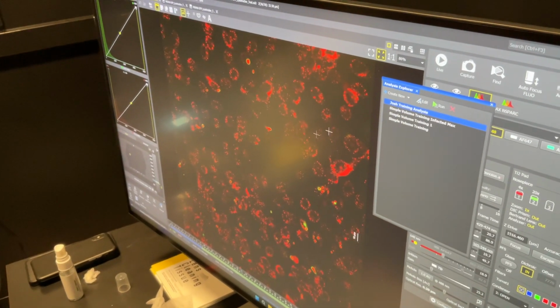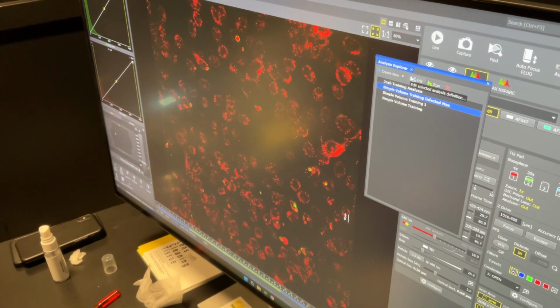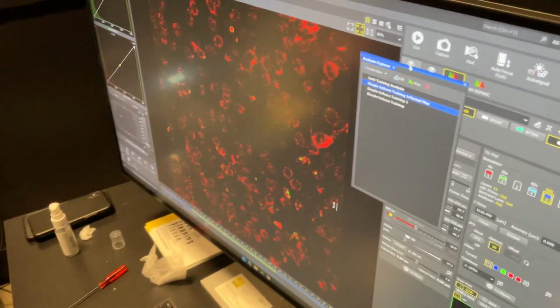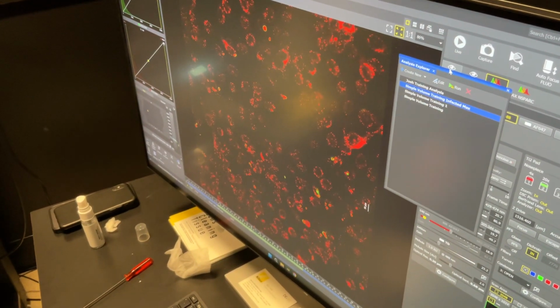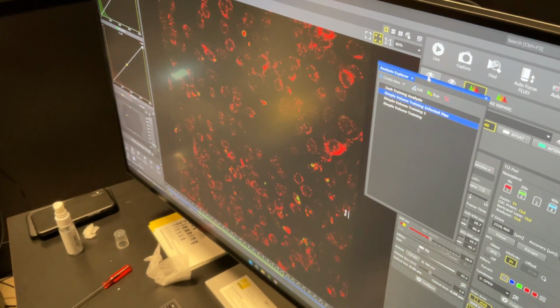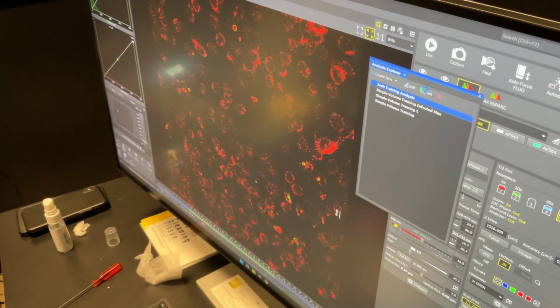This one was yours, so we have different numbers of channels. It would probably run, but it would kick out a warning that it doesn't match. Old GA3 pre 6.0 would not have even run. It wasn't flexible enough to account for that. A newer version can, which is nice. So here you just hit run.